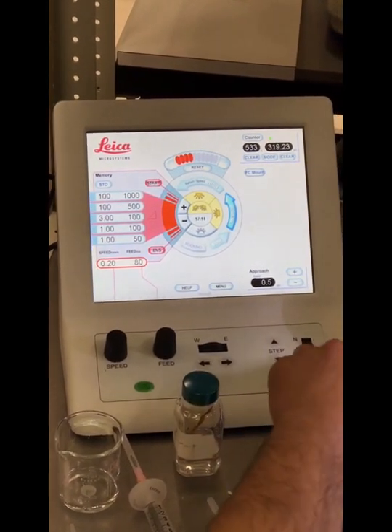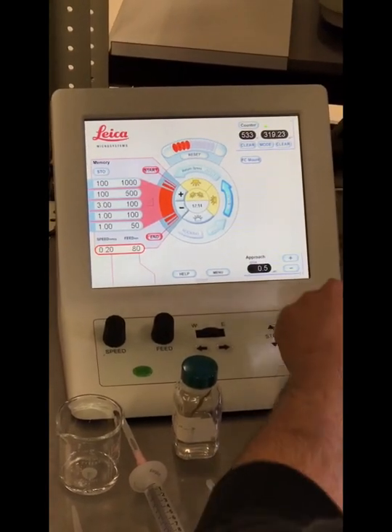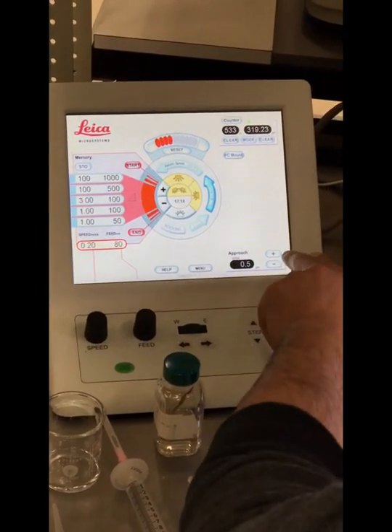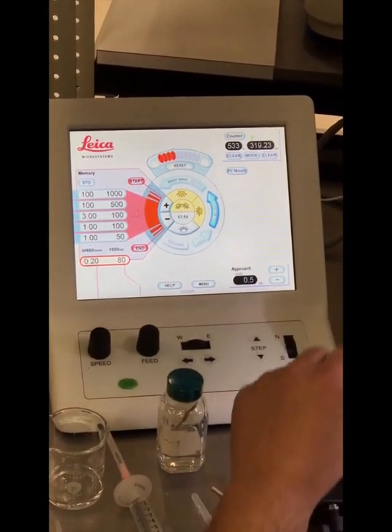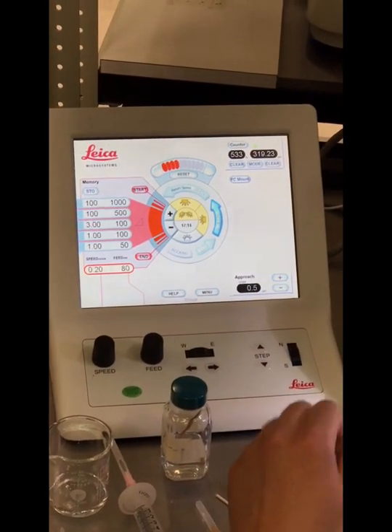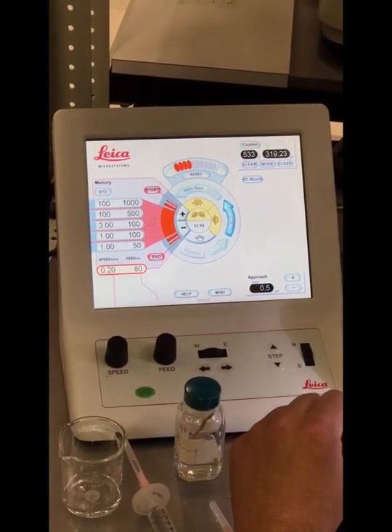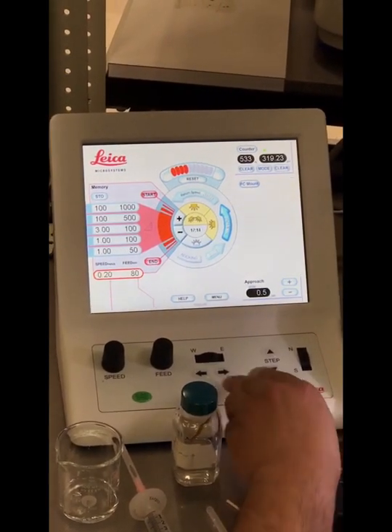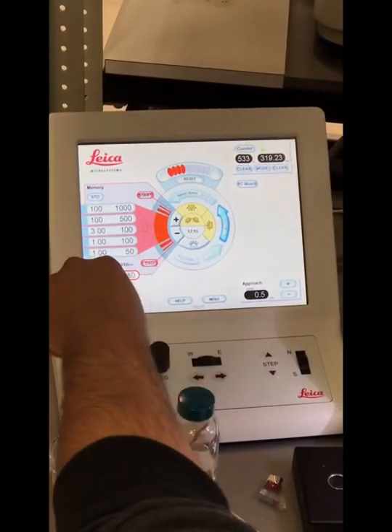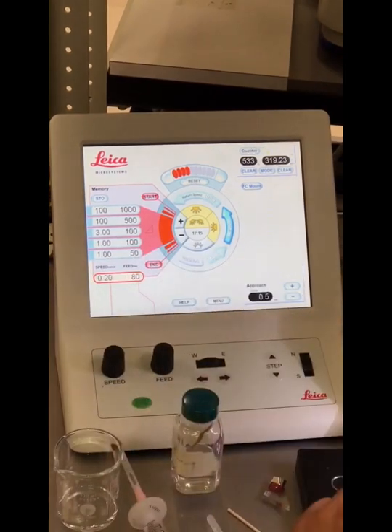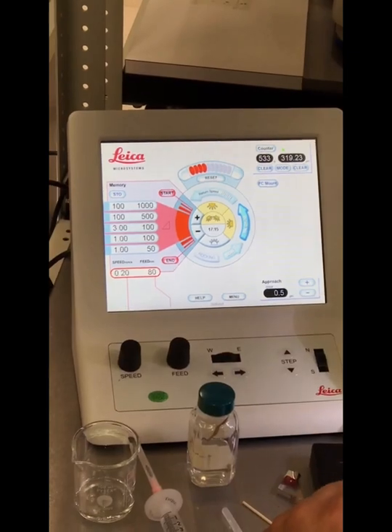North and south step size setting is right here. This is the coarse movement, and this is the step setting. This is the approach. Your east and west fine movement settings are here. The east and west step and continuous movements are here. The feed setting is here, as well as the cutting speed setting, and the start and stop for the motorized cutting.